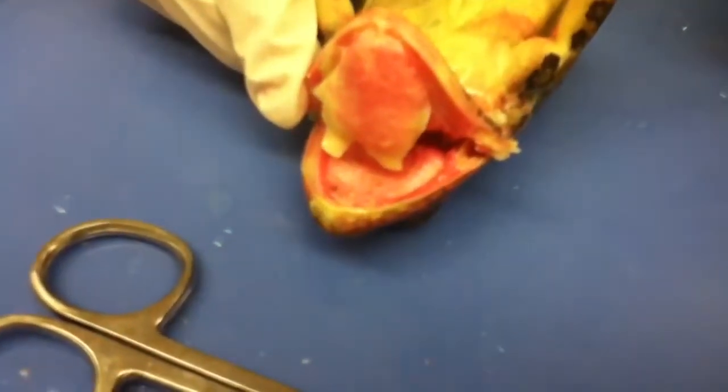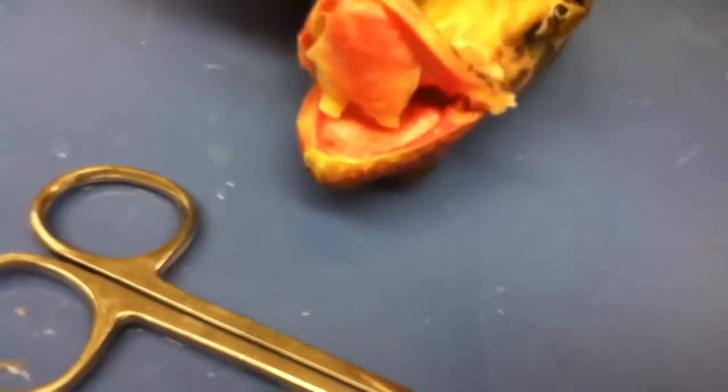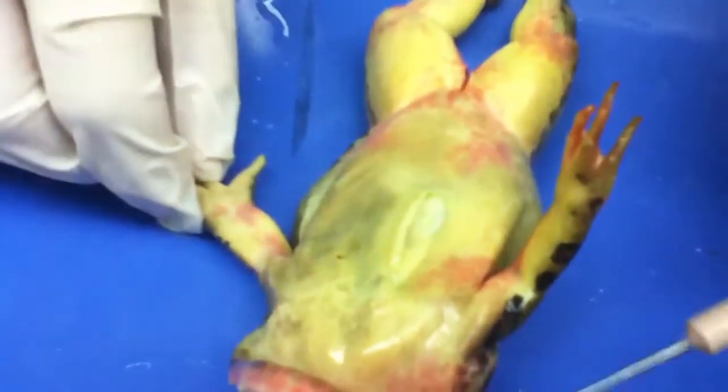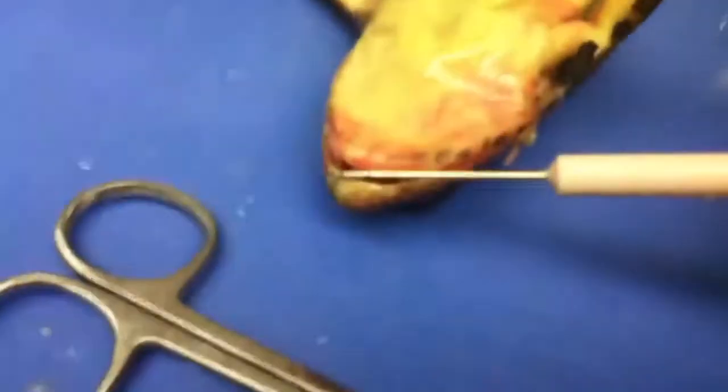That was a guy. I said he. Okay. We don't know what it is yet. We're guessing it's a guy because of the pads in his hands, but we don't know. Hey, look, at least it will be easier to cut him open because he's already cut. His mouth is like open.